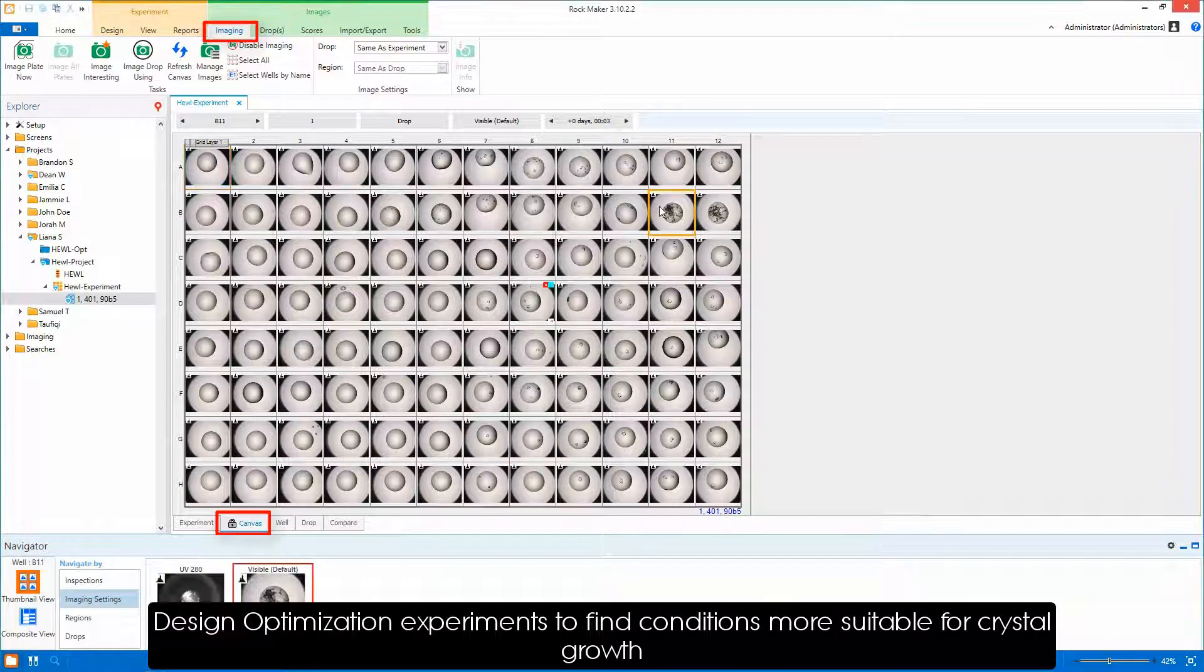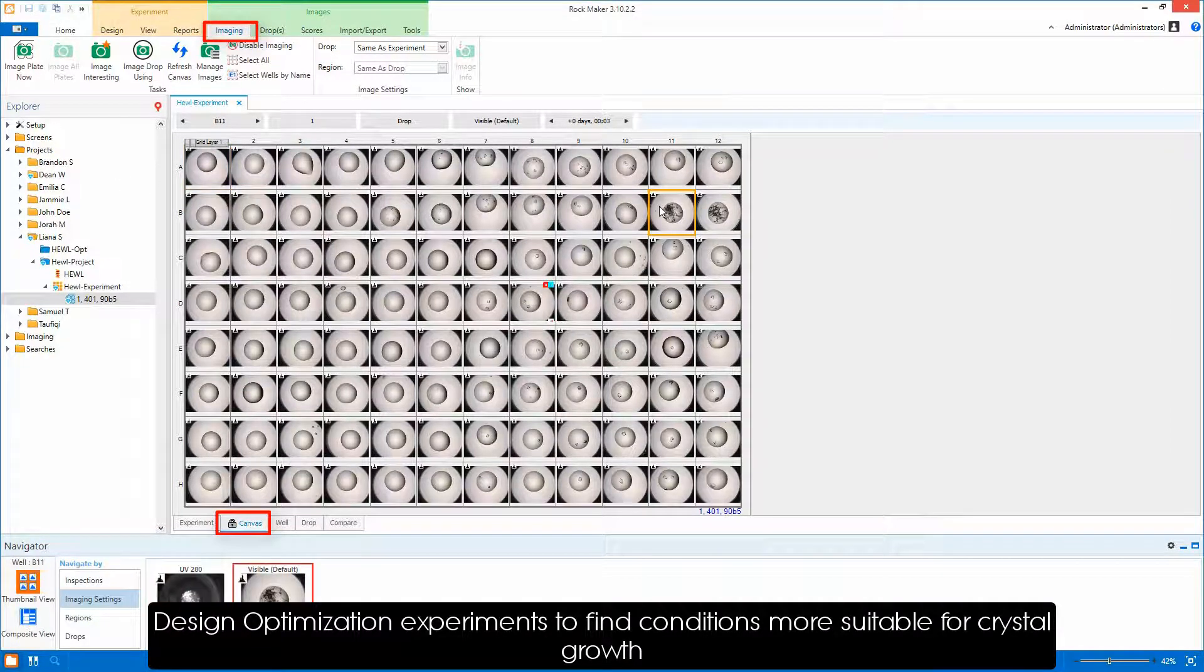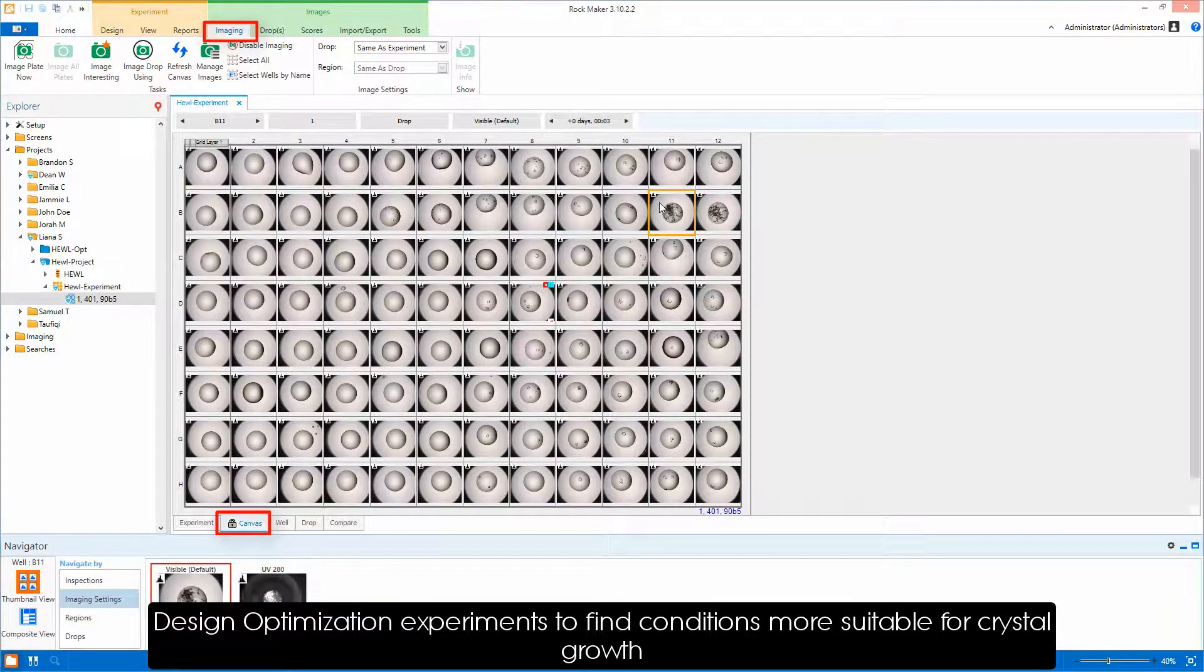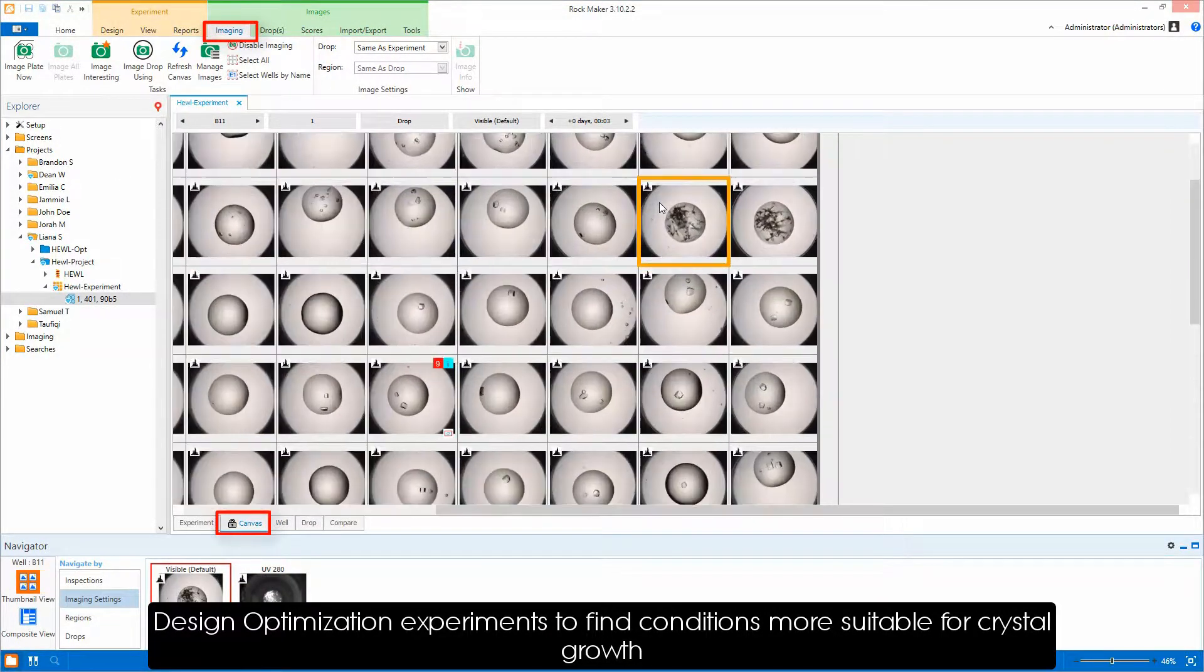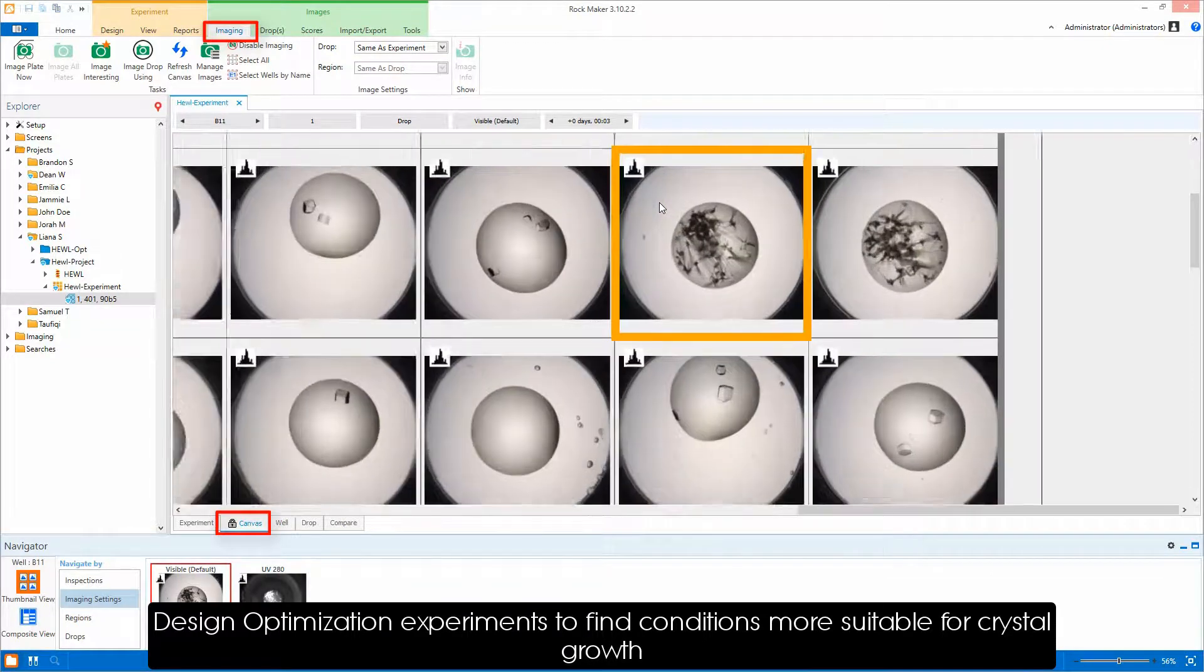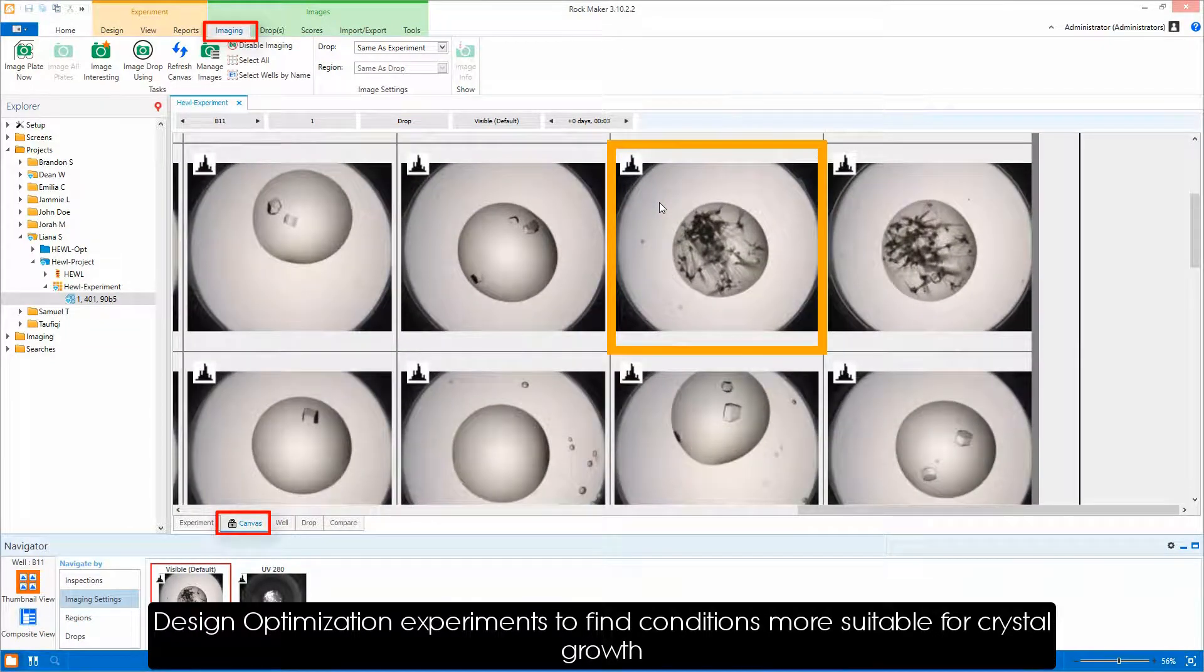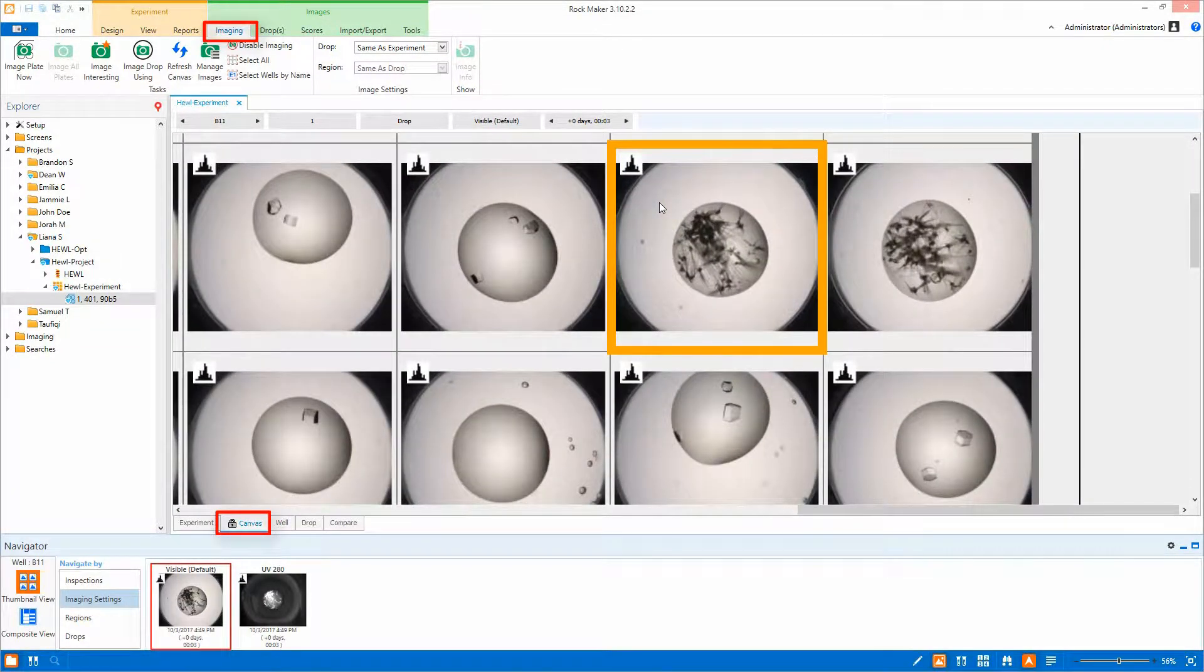Did you just find an interesting condition? Rockmaker can help you design an optimization experiment to zero in on the exact conditions that promote crystal growth.